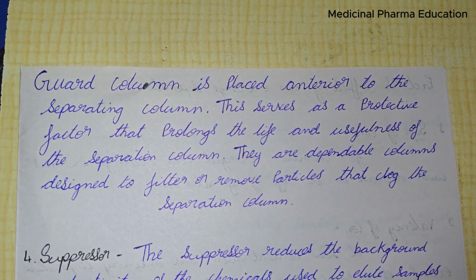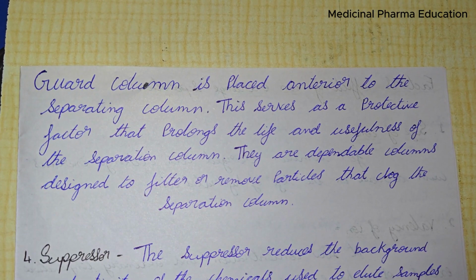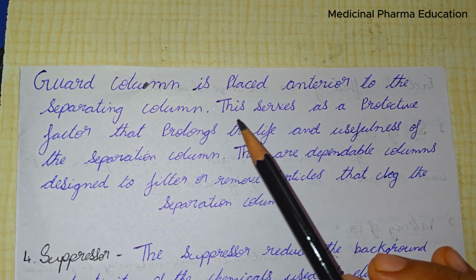Next, the guard column. Do you also use it in HPLC, and in gas chromatography? No, in gas chromatography, I think so. We have not covered it. Just comment if we are using the guard column in HPLC or not. I mean, in HPLC we're using it; in gas, I don't know. I have not completed it yet.